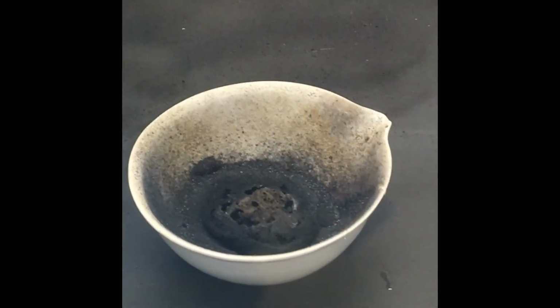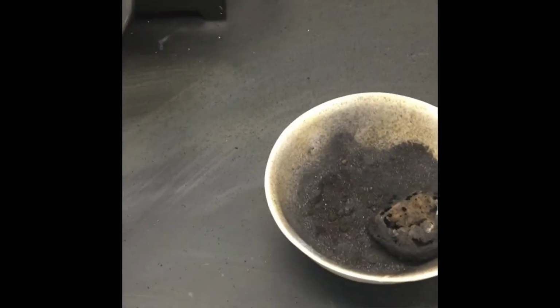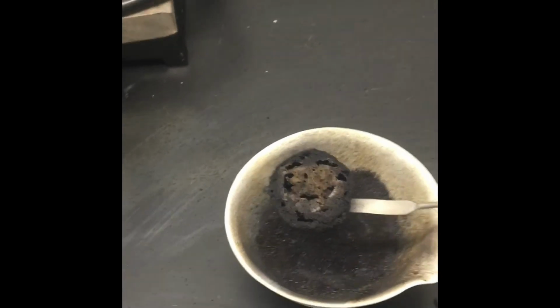Now let's look and see how this looks inside. Okay. So very solid right here. And actually, I probably still have some potassium there that I can still ignite. Let's see if we can get some more. So this is like a little cake.